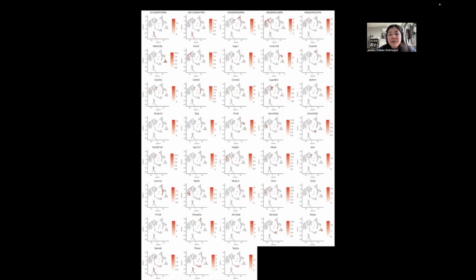So that can start giving us an idea of whether we observe the high expression in a particular cluster. So what you expect to see is that each of these genes is particularly expressed in certain regions of your dimension reduction plot. For example, here, this one seems to correspond with one of the clusters, while let's say this gene seems to be more highly expressed in this cluster over here, or this gene seems to be more highly expressed in this cluster over here, right?